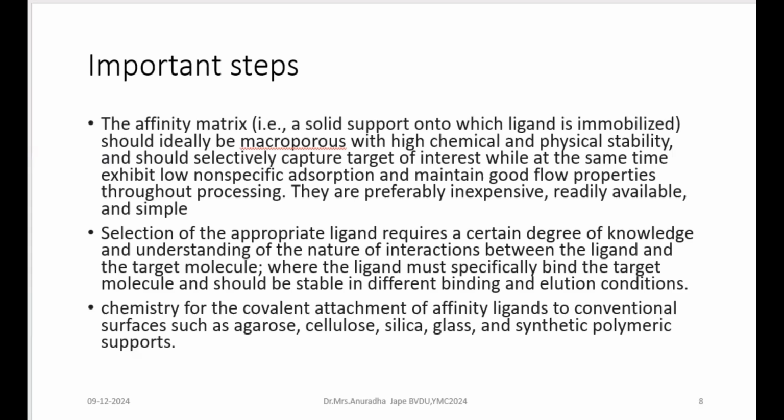and it is not going to get compromised when the column is actually run, right? It's not that always HPLC is run. Without high pressure application also, or MPLC, that is moderate pressure liquid chromatography, or MPCC, you have to run liquid chromatography at normal gravity force. They will be running on their own, right?